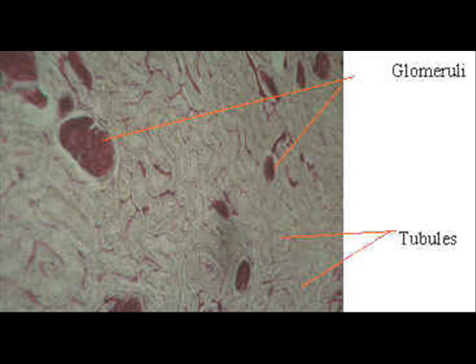Pancreas has characteristic light staining islets with ducts and septa. Thyroid has pinkish follicles which cannot be missed easily, and testes has thick tubular walls.